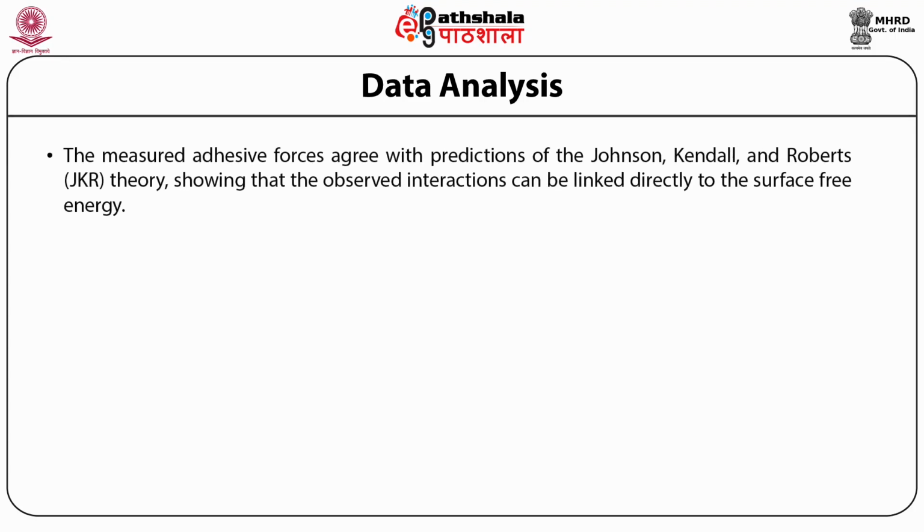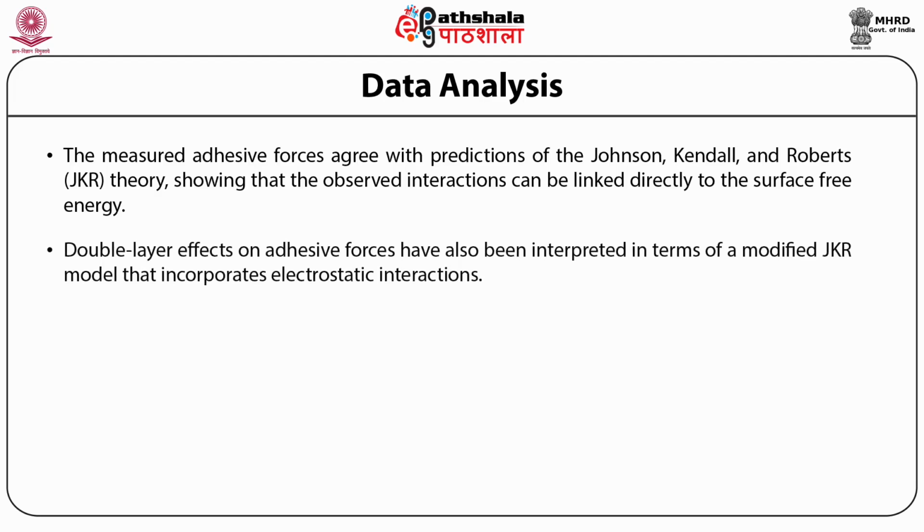The measured adhesive forces agree with predictions of the Johnson, Kendall and Roberts theory, in brief the JKR theory, showing that the observed interactions can be linked directly to the surface free energy. Double layer effects on the adhesive forces have also been interpreted in terms of a modified JKR model that incorporates electrostatic interactions.